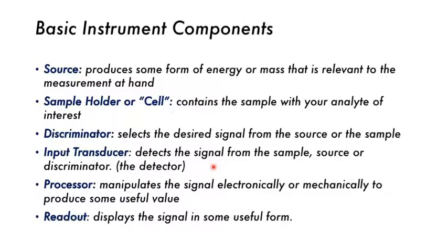So what happens is that the light has some intrinsic energy associated with it, and after it's passed through the sample, it hits this detector, and that produces some sort of energy change in the detector, which can be detected by the electrical circuit it is connected to. Then that signal, produced by the light hitting the detector, can be measured using the computer, and then we can get our output. Again, we'll talk about that more in detail later.